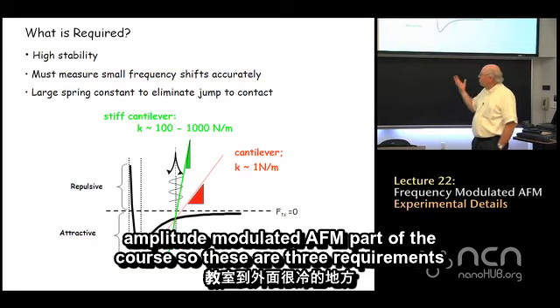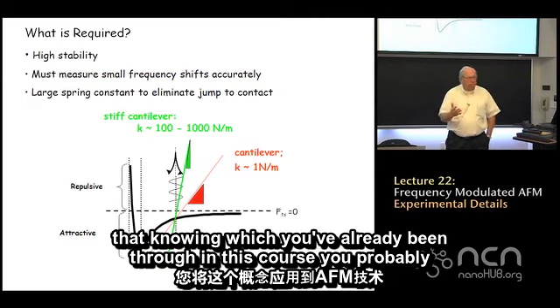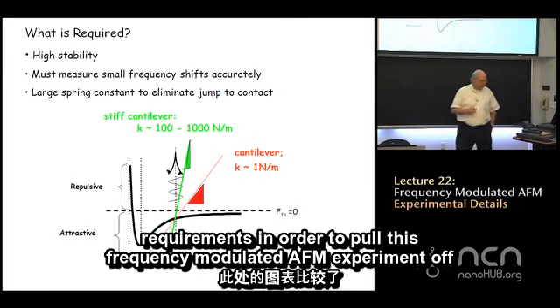So these are three requirements that, knowing what you've already been through in this course, you probably might have been able to surmise, right, as requirements in order to pull this frequency modulated AFM experiment off.